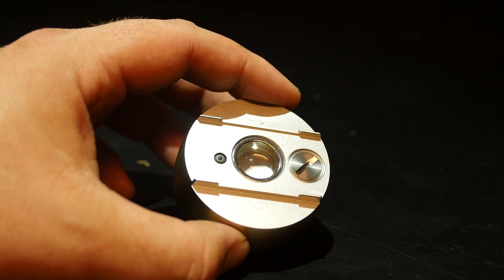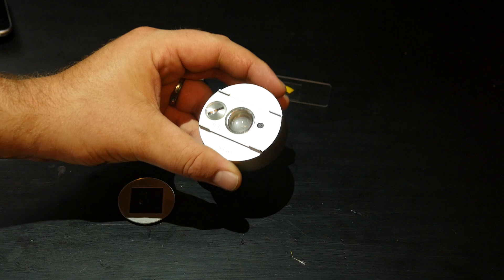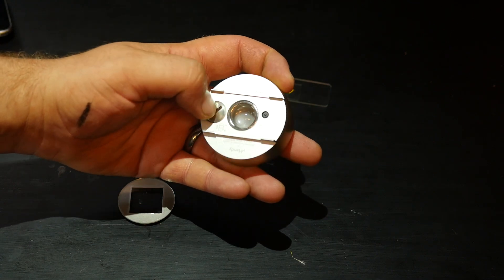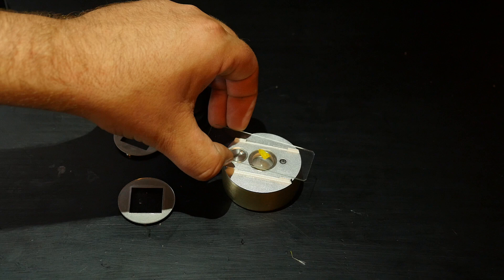This is how it works basically. It's got this little aluminum-type body — you can see it right there. It holds batteries right here. You unscrew this and put three batteries in there, then tighten it back down. It will stay off until you actually put a slide in it.